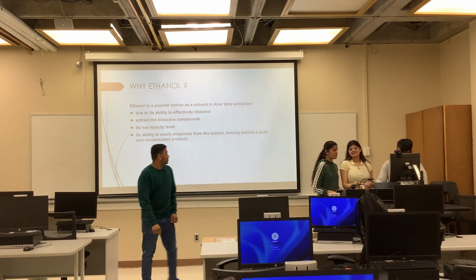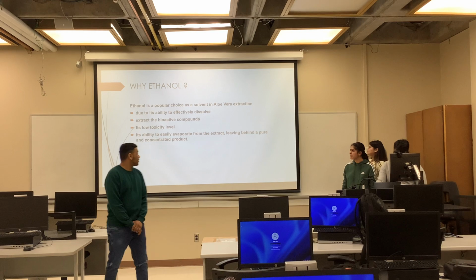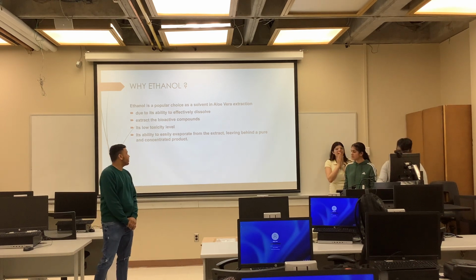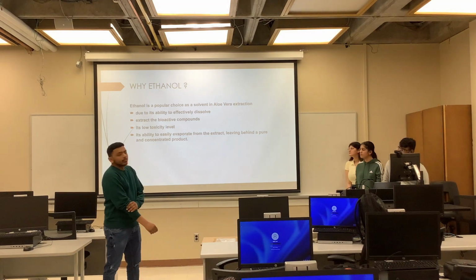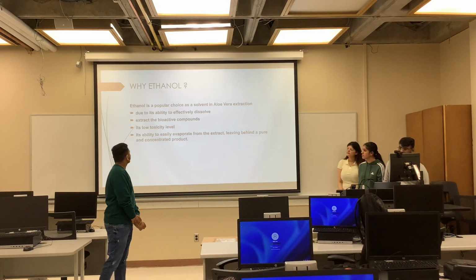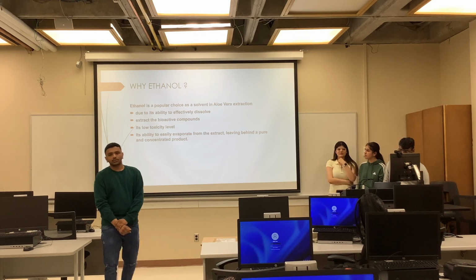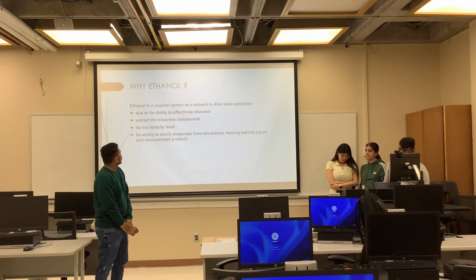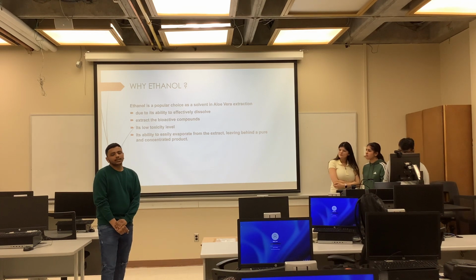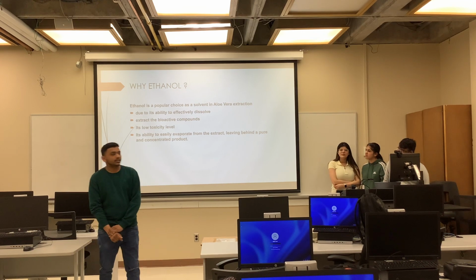So as Aman told, we already decided our work plan, but we were not able to work on it, so we have made a little bit of change. The first problem that we came to know was the selection of the solvent for our aloe to get the best yield. For that we selected 2 options, either ethanol or diethyl ether.